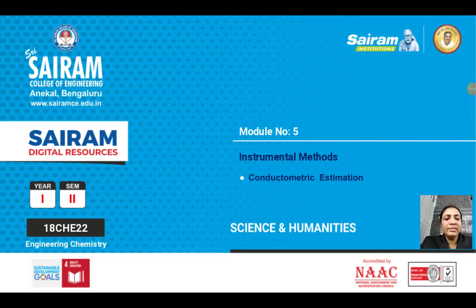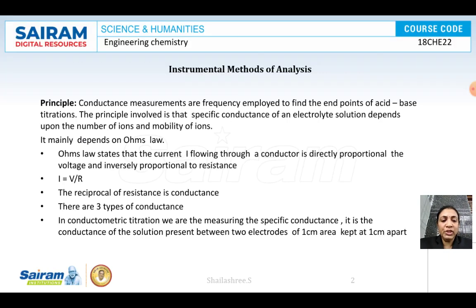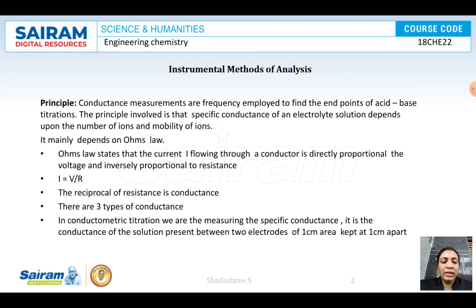Hello dear students, we are in module number 5 and in this session we are going to discuss the conductometric estimation. Under module number 5 we have started with the instrumental methods of analysis and completed the potentiometric estimation of redox titrations. So in this session let us discuss the conductometric estimation: theory, instrumentation and applications of the conductometric experiment.